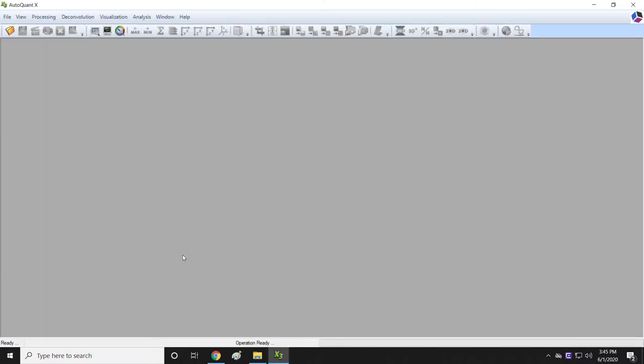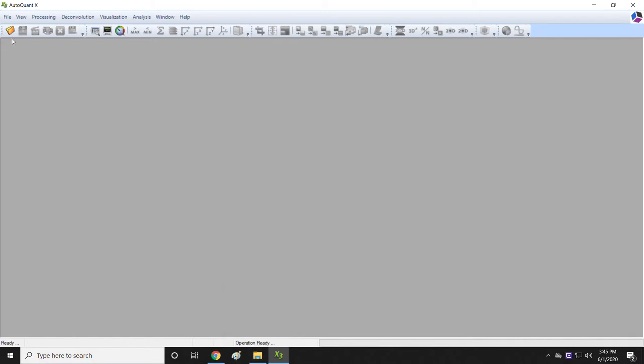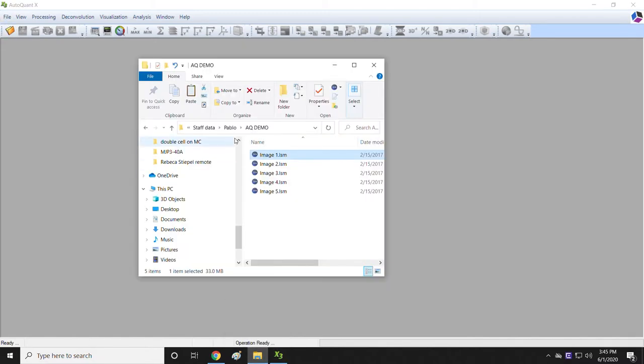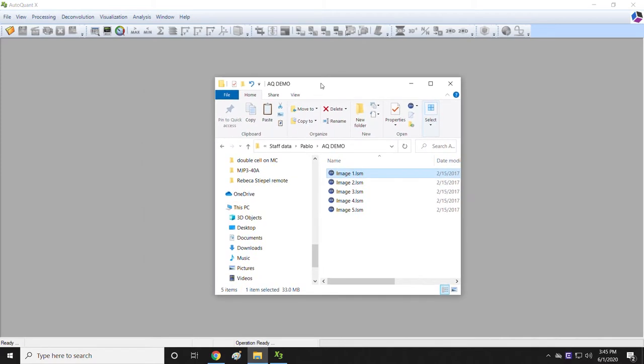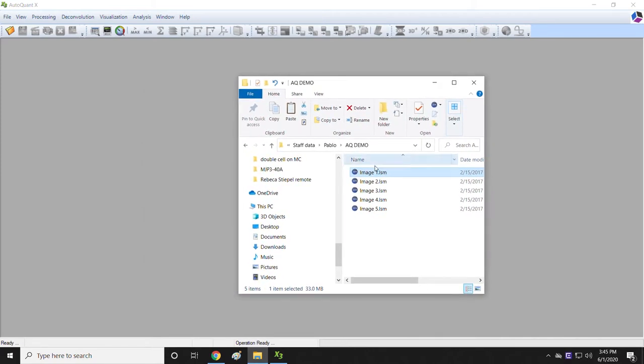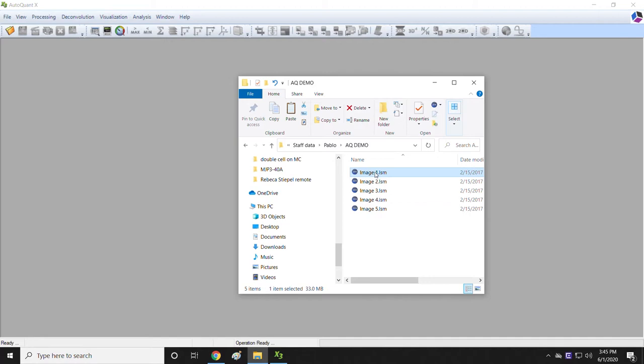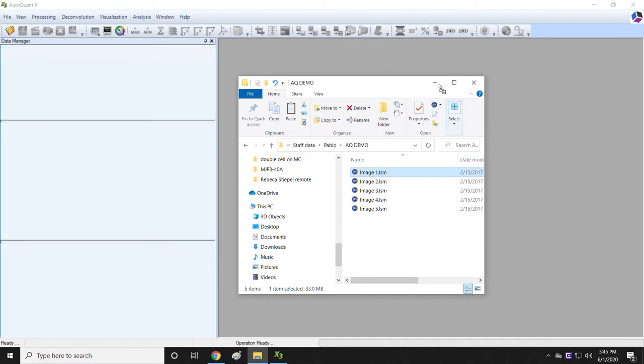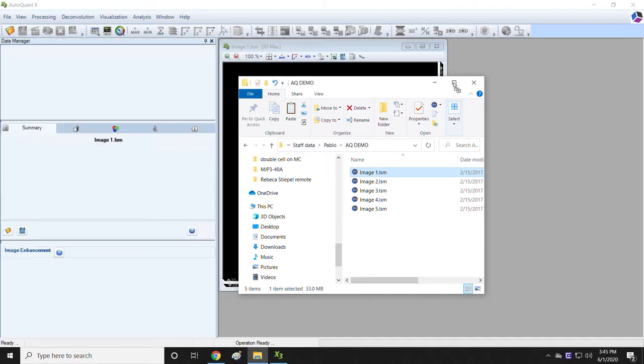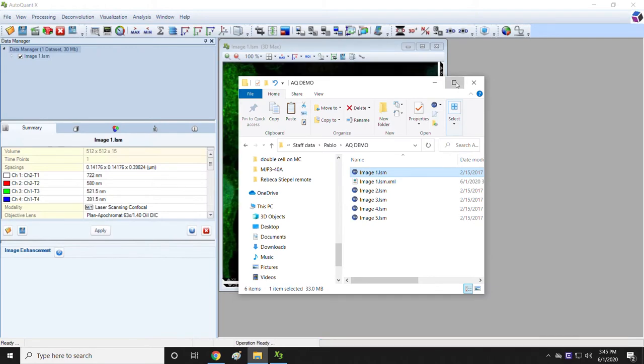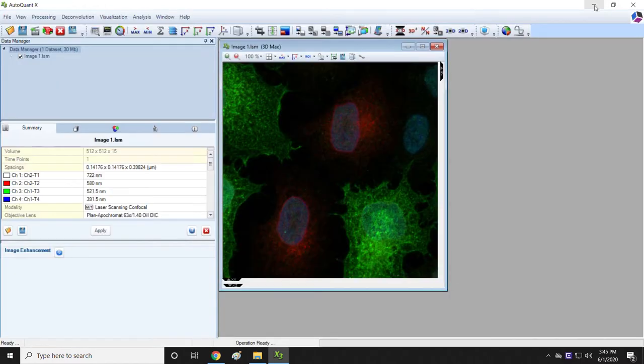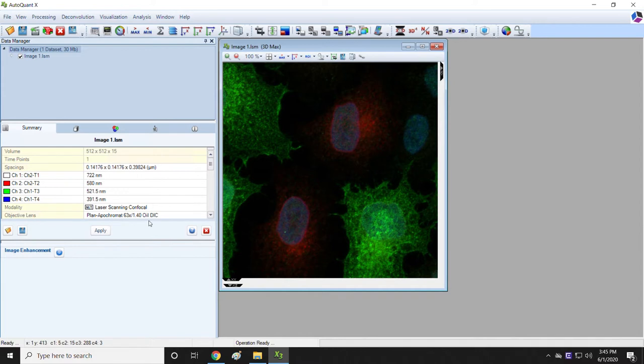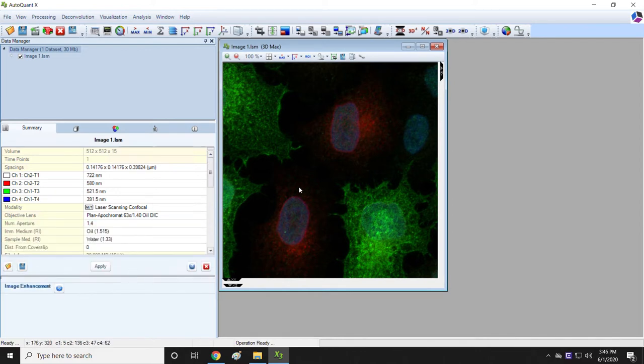This is the AutoQuant window. To open things, you can use this icon, you can do file open, or you can just drag stuff in. Because I want to start by just deconvolving one image, I am just going to drag one image into AutoQuant and work through that example. When you drag in a single image into AutoQuant, AutoQuant automatically detects a number of things from that image, and those things are noted here, and it automatically gives you a visual representation of that image, which is this here.